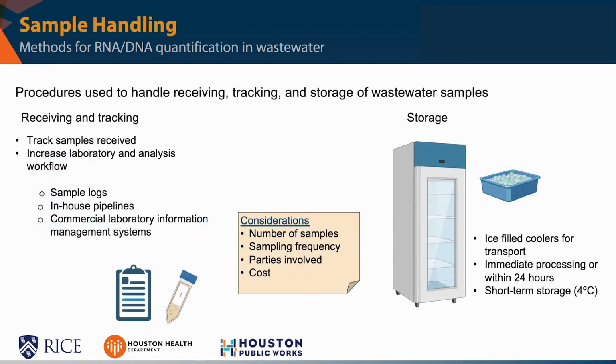Here, sample handling includes procedures used to handle the receiving, tracking, and storage of wastewater samples upon arrival to a laboratory facility. Implementing a system to receive and track samples is important to ensure all samples are accounted for and the proper information is attached to each sample for downstream analysis.